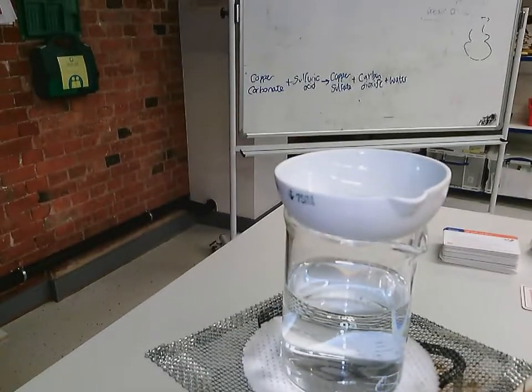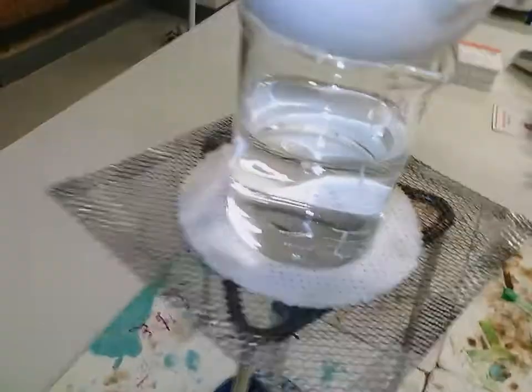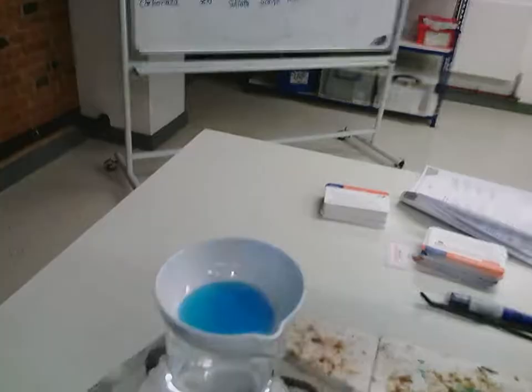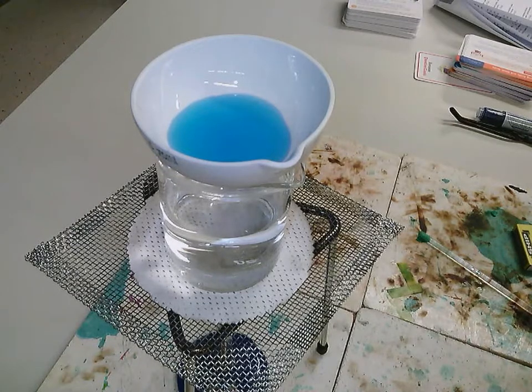Now, how you do this second part of the experiment, on the practical it says it wants pure copper sulfate. This is copper sulfate and water. Now, when you make these, usually in school, you'd probably heat this until the water's mainly just evaporated, and then after that, you would leave it in the window and it would evaporate. And you'd form big blue crystals that look like diamonds. But that's still got water in it.